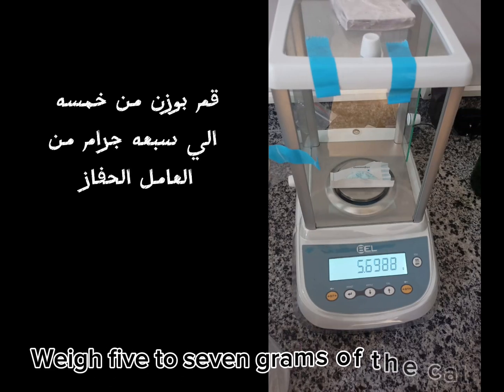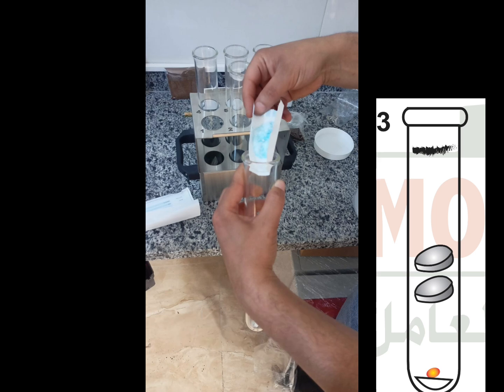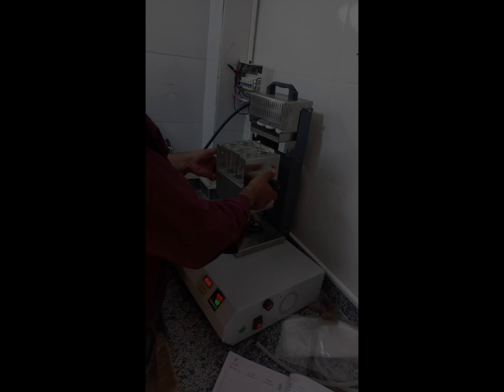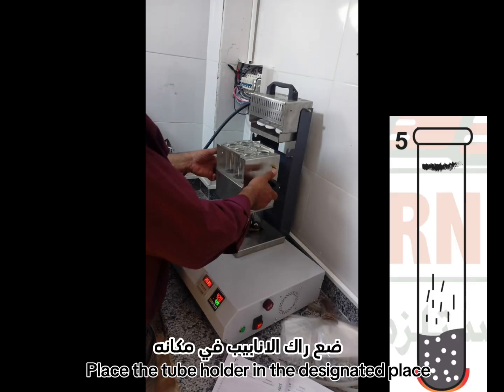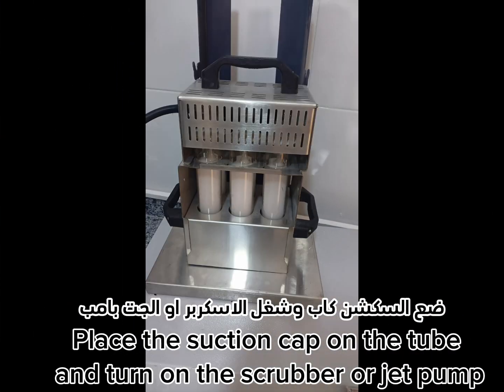Weigh 5 to 7 grams of the catalyst and put it in the tube. Add 15 ml of sulfuric acid to every tube. Place the tube holder in the designated place on the device when it reaches 420 degrees. Place the suction cap on the tube and turn on the scrubber or jet pump.